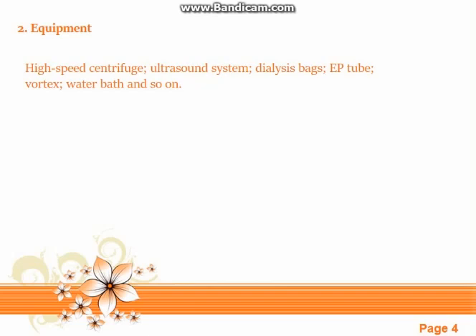2. Equipment. High-speed centrifuge. Ultrasound system. Dialysis bags. EP tube. Vortex. Water bath and so on.